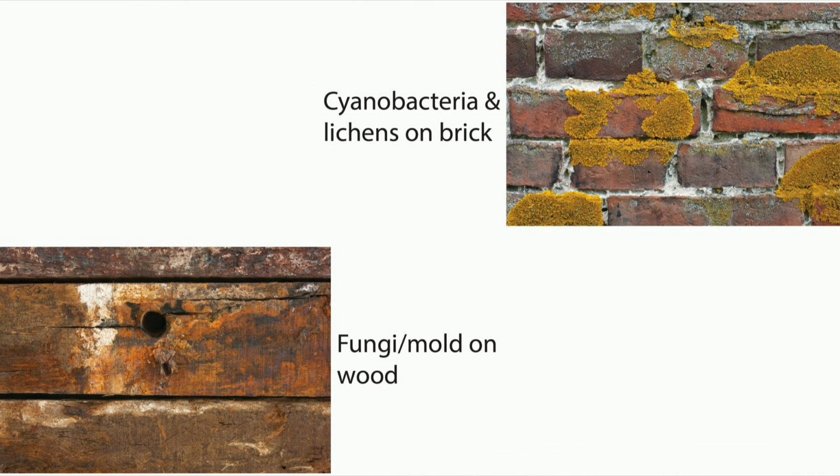Most of the identified microorganisms are implicated in wood and brick deterioration. Metabolomics analyses of these samples confirmed that the activation of secondary metabolite pathways was associated with organic acid production and organic compound deterioration. Overall, next-generation sequencing helped in identifying 99 bacterial genera and 113 fungal genera from Auschwitz artifacts.